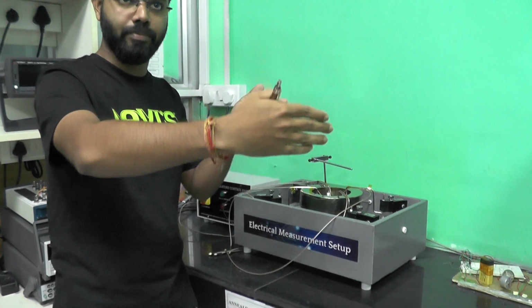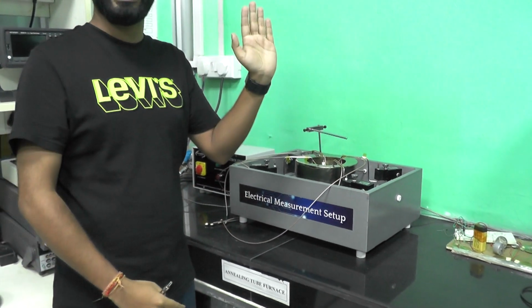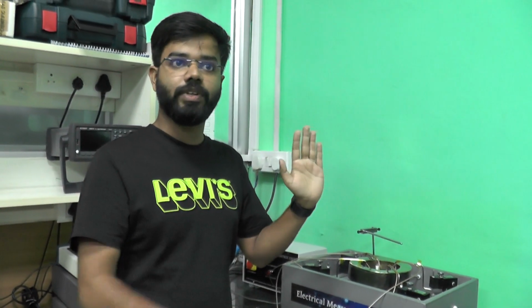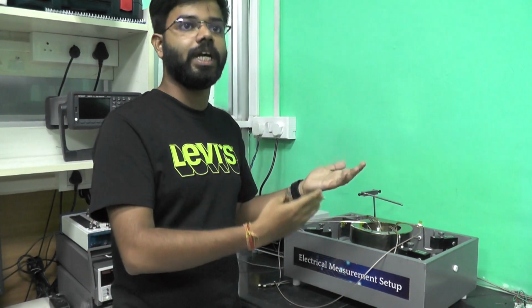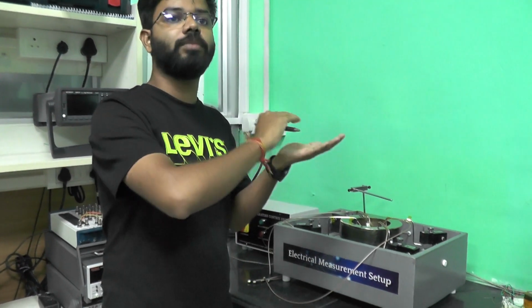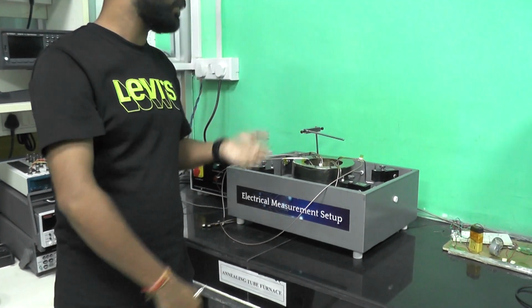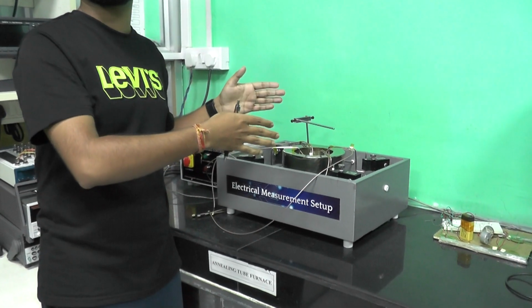The sheet, as we have grown it, is first in the amorphous stage, but as we increase the temperature, we know that the thin film will go from the amorphous to the crystalline phase at a certain temperature. That is what we are trying to measure using this four-probe measurement system.